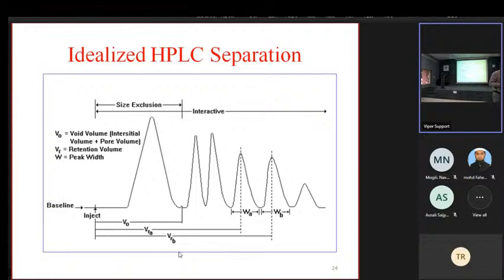But as students in the laboratory, we are not regularly doing the calibration. In industry, every time we need to calibrate by a specific method and write the report saying this instrument is calibrated by so-and-so method, and so-and-so chemist did the calibration. We can't use the same calibration method for reverse phase HPLC and normal phase HPLC, or for the kind of materials or adsorbents you're using. So we have specific calibration methods.